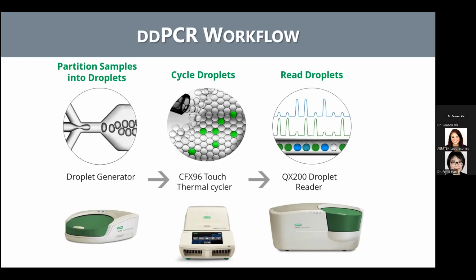In the end, after the thermal cycling is completed, the droplets are transferred into a droplet reader. Based on the analysis of the fluorescence signals, the ddPCR system generates results that allow for the determination of the linkage between the target genes, in other words, the co-localization of STX and EAE genes within the individual cells.